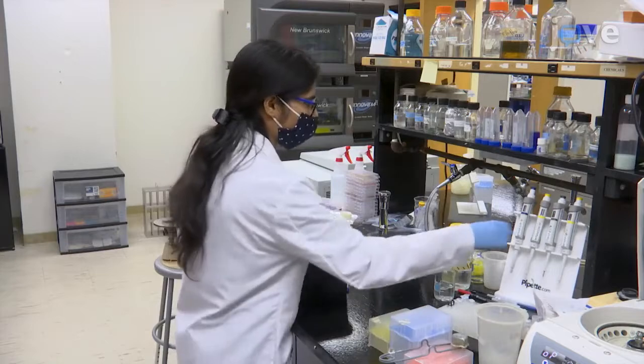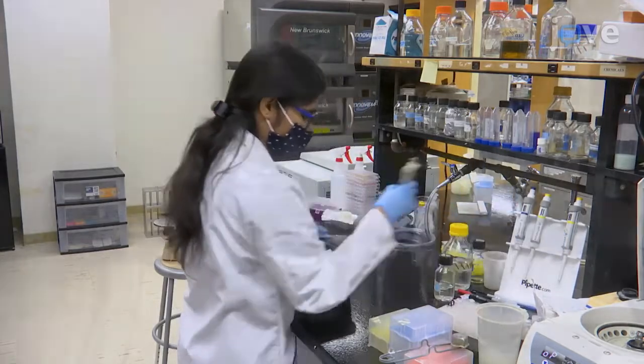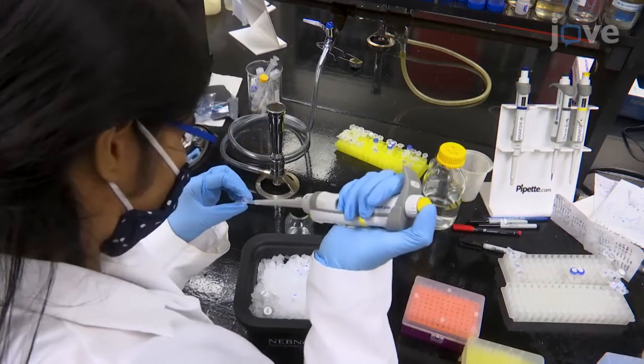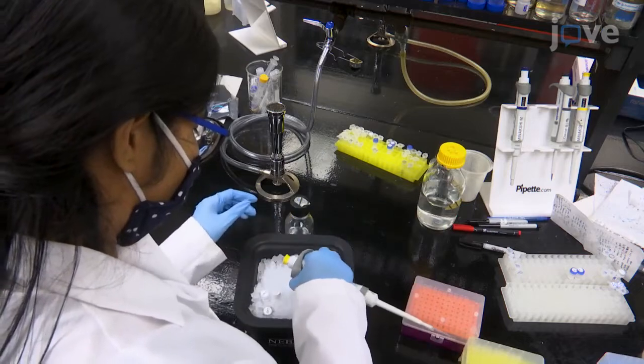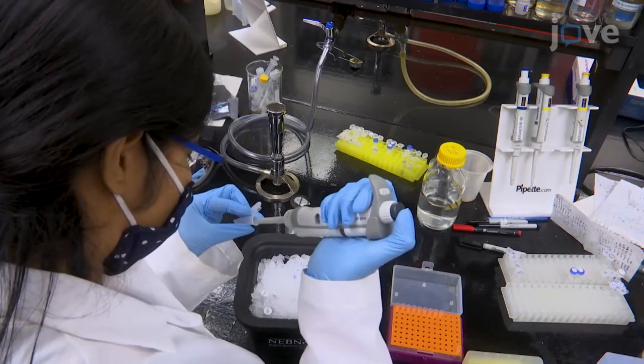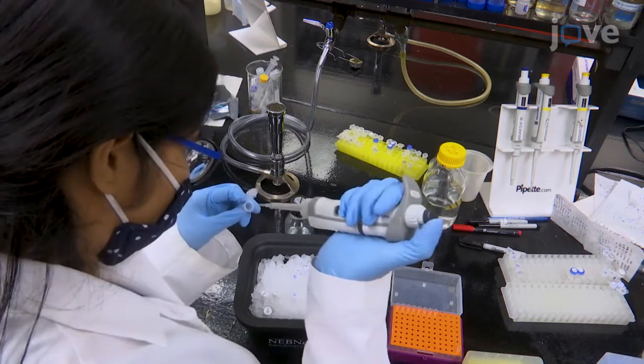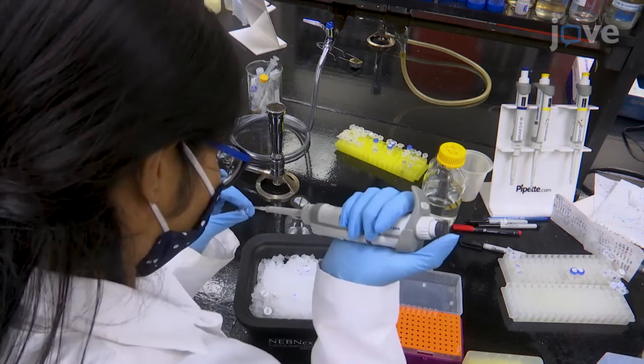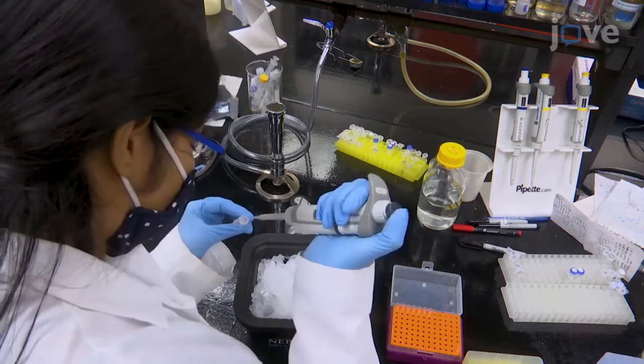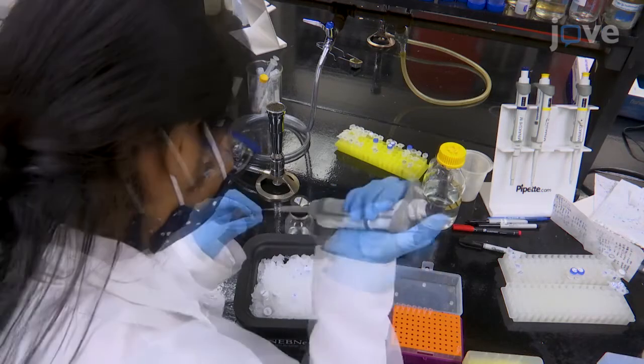Begin by setting up the Golden Gate reaction mix. Add 20 femtomoles of each PCR product and the entry vector, 1 microliter of 10X T4 ligase buffer, 0.5 microliters of ESP3I, and 0.5 microliters of T4 ligase.